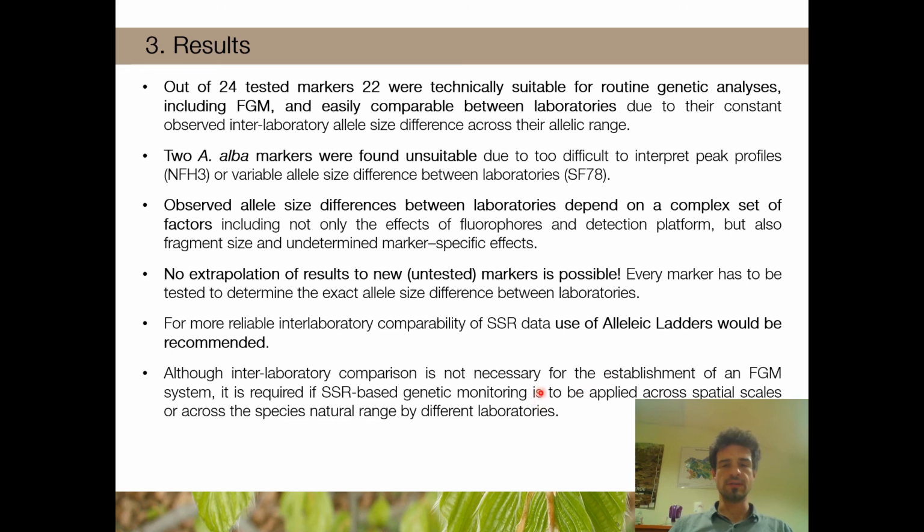Interlaboratory comparison is not necessary for the establishment of genetic monitoring system itself. However, it is required if microsatellite-based genetic monitoring is applied across spatial scales or across the species natural range by different laboratories.